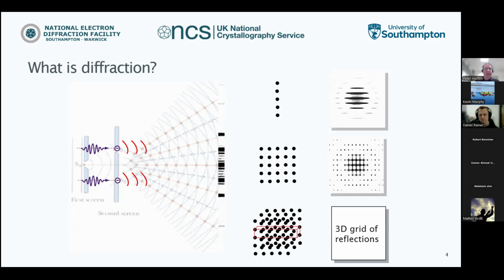And the other thing, the X-rays, although it's based on spacing between atoms, what they actually interact with is the electron cloud. So the number of electrons has an effect on how the diffraction occurs. You can imagine very light elements, especially hydrogen with one electron, moving around, don't give much diffraction, whereas the heavier elements give a lot more diffraction and are much easier to observe.